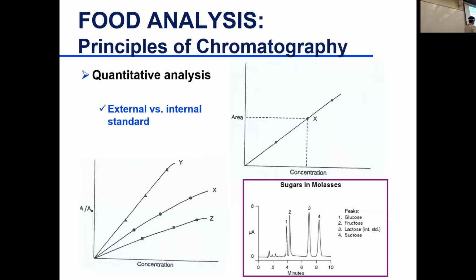But the difference here is how you prepare your standards. Let's say I'm just going to say glucose. I add to it lactose. Or if I'm doing C18 oleic acid, with the one double bond, I add C4. Okay, in my standard.